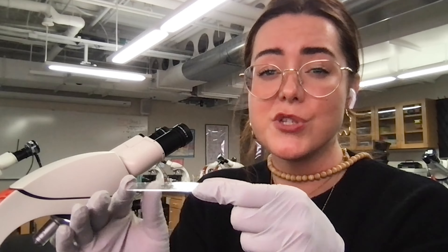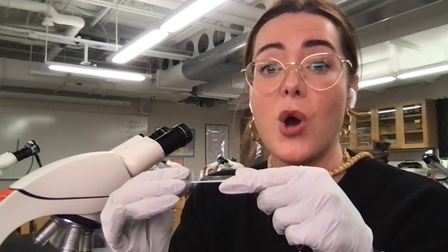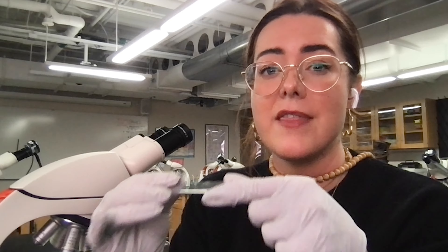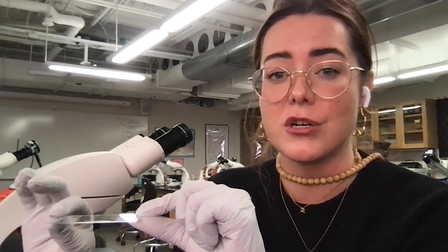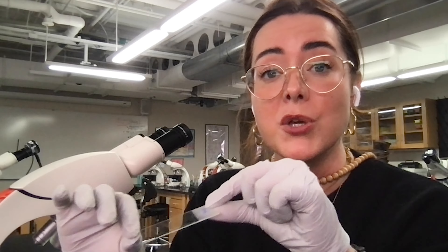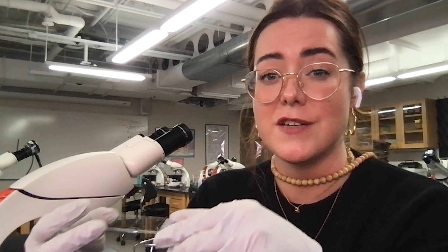Our yeast cells will still be pretty small at 20x. So in order to actually appreciate the phenotype of these cells, you'll want to go up to 63x, and that is the magnification that you should be taking a picture of your control, which is the yeast grown at permissive temperature, compared to your mutant phenotype, which is your yeast cells grown at that higher restrictive temperature for several hours.